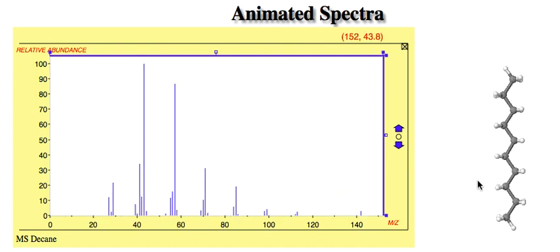And looks pretty much like that. This one is now decane with 10 carbons. And way out here, you could see at 142, that's going to be 10 carbons, which is going to be 120 and 22 hydrogens. But that's pretty fragile, and it breaks up into chunks, and you start seeing each one of these evenly spaced little blobs is a shorter and shorter chain. This is not going to stay stable as a positive ion.